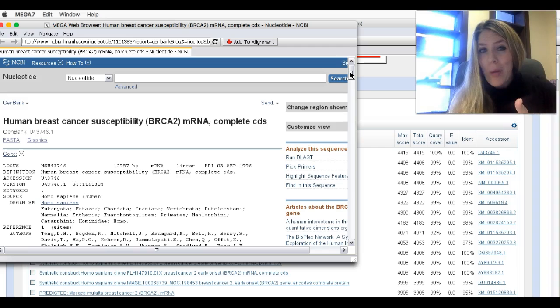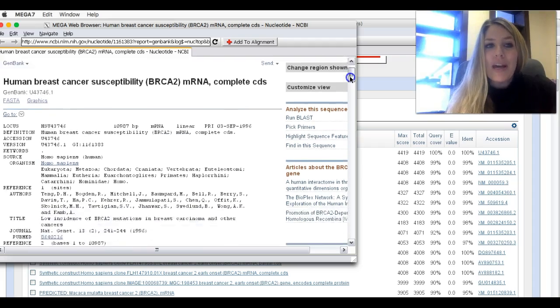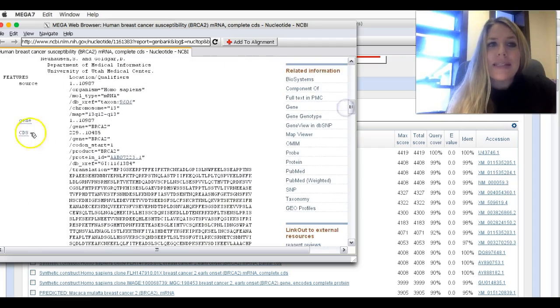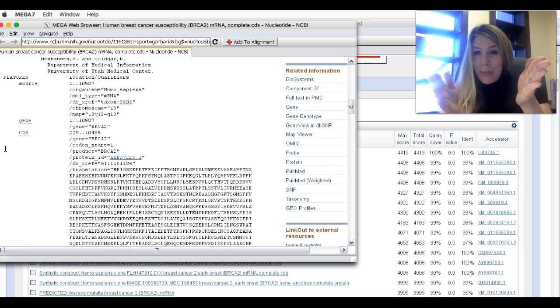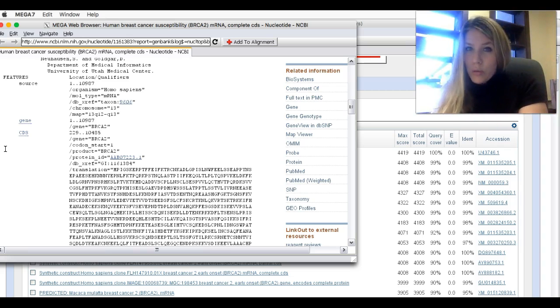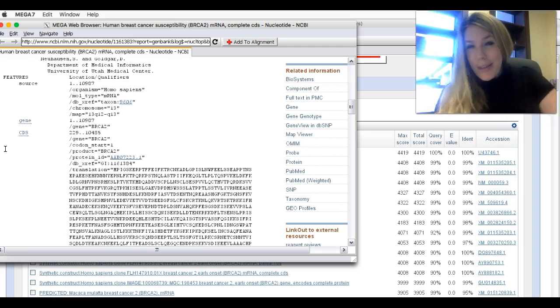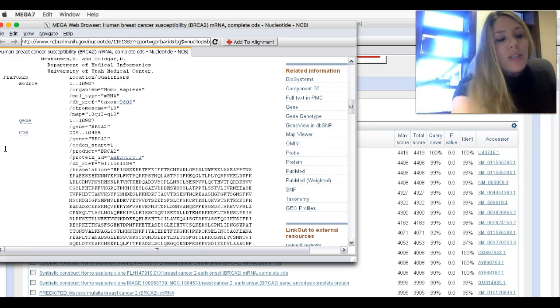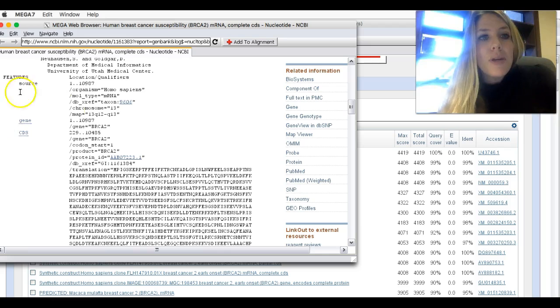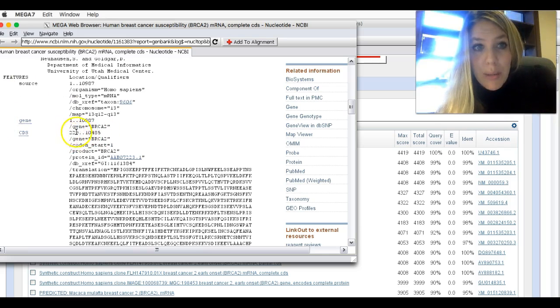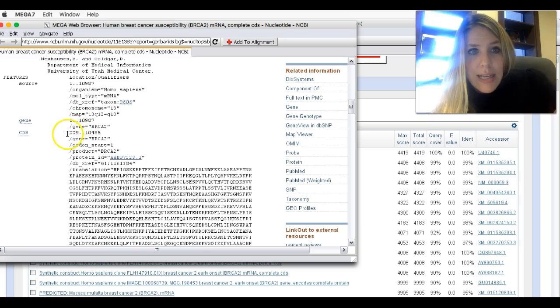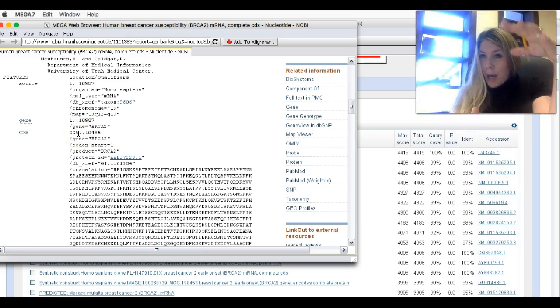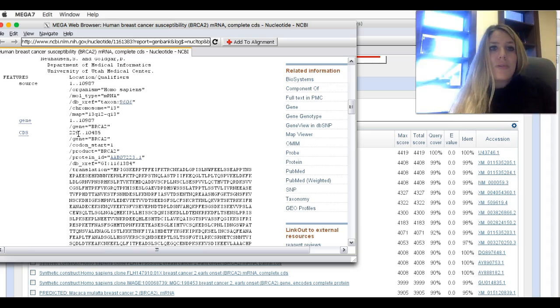What I want you to do now, I won't explain right now why you're doing this, but I'll tell you in a little while. I want you to scroll down and find where it says CDS. That means coding sequence. This is going to give you which base number in the sequence starts off the actual part that codes for a particular amino acid and for the protein. You need to write this down. So I got my pencil and some paper here. I'm going to write down human. And I'm going to write the base number that starts this sequence. In this case, it says 229.